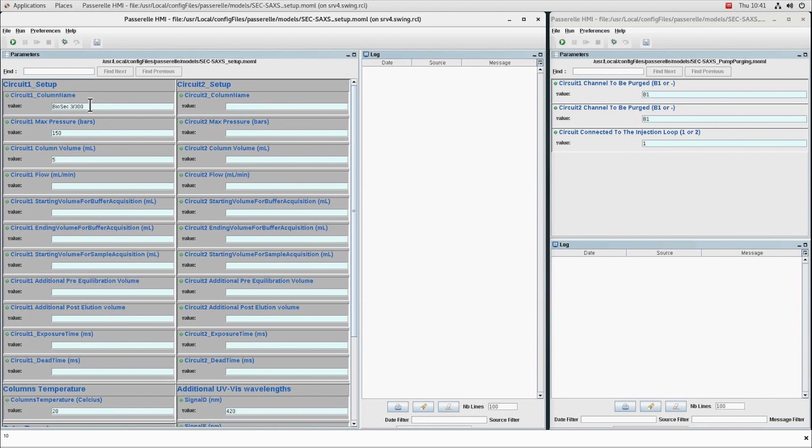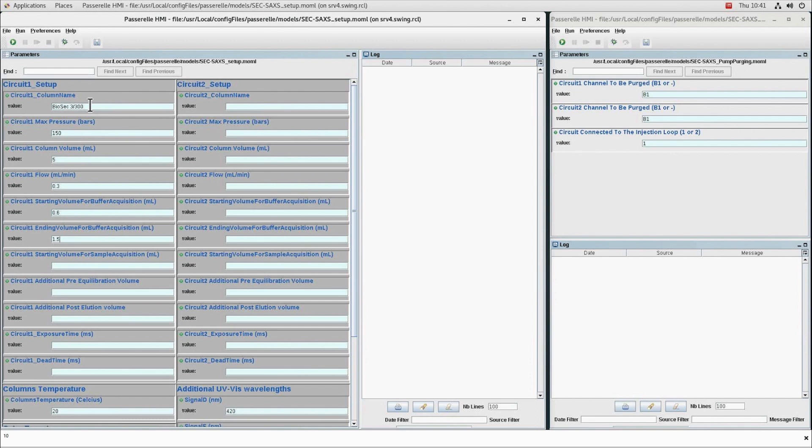The elution volume which will define the start of the buffer acquisition after injection, the elution volume which will define the end of the buffer acquisition before the dead volume.